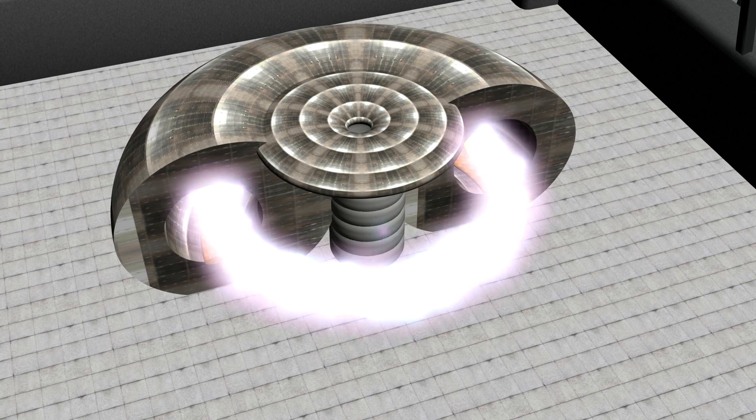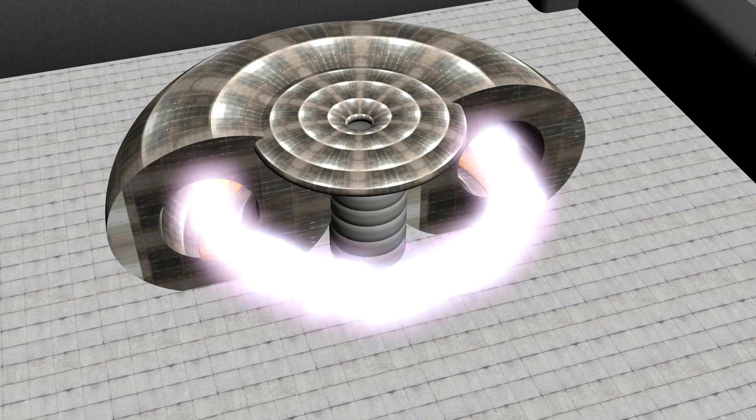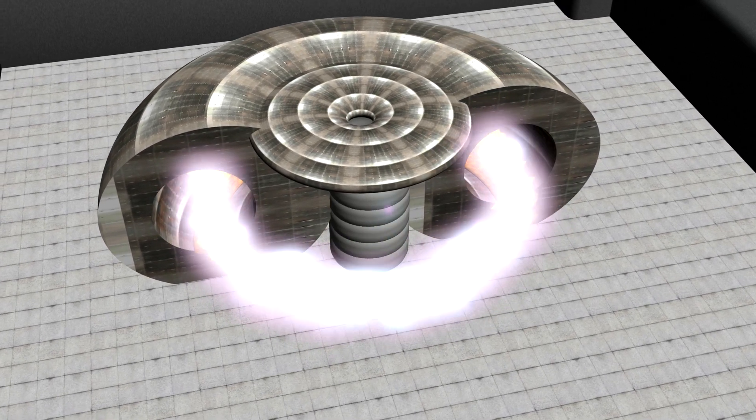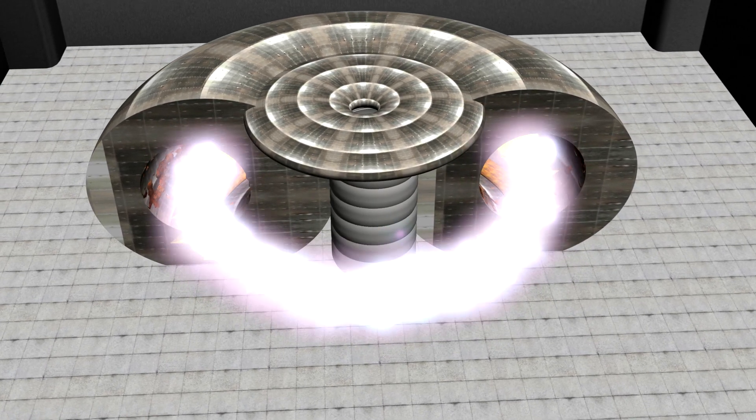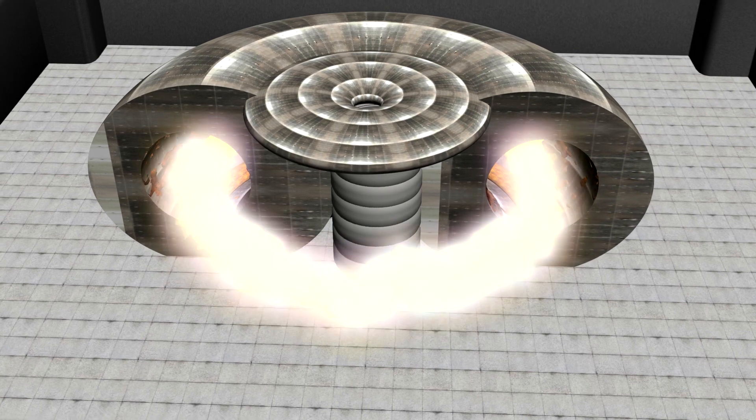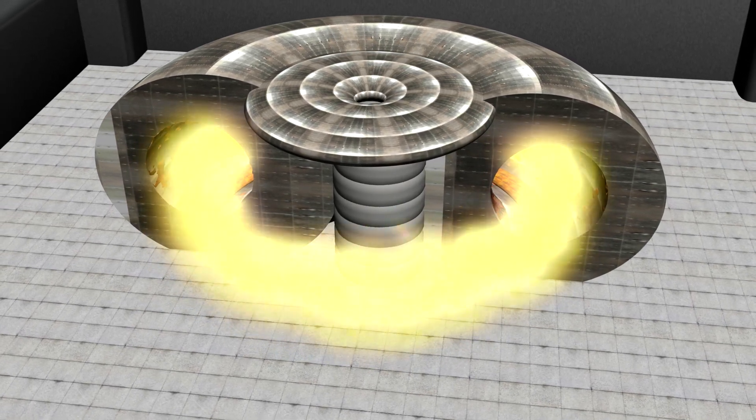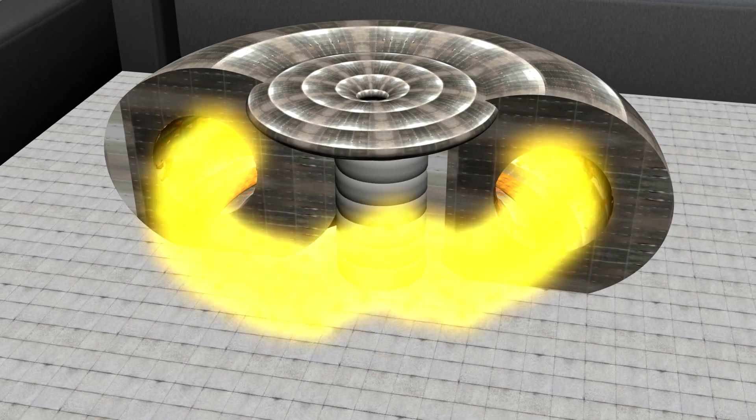Such gradual degradation of the fusion reactor's inner walls and other components is actually quite bad, as it pollutes the plasma with heavy particles that absorb more energy. This ultimately causes the plasma to become unstable.